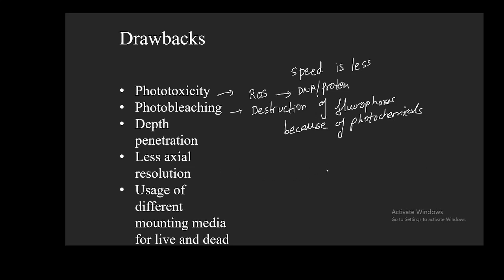And what is the axial resolution? One is the lateral resolution and one is the axial resolution. Suppose these are your 2 points in your image and light is coming perpendicular to this, then this is known as the lateral resolution, and axial resolution is this one. If this is your sample, this is your axis, light is coming parallel to this. This is known as the axial resolution.